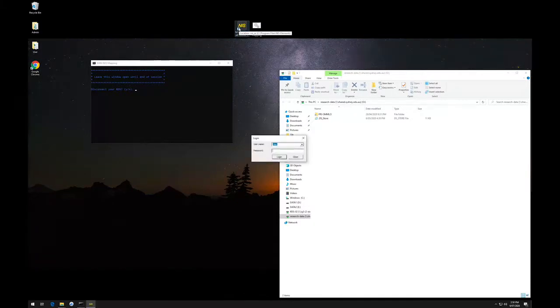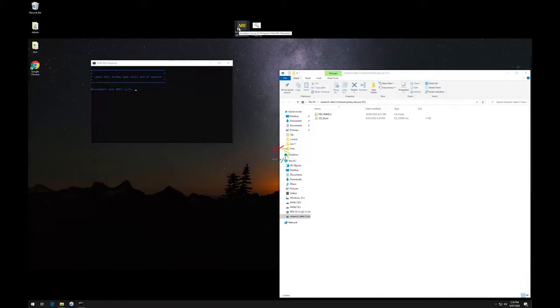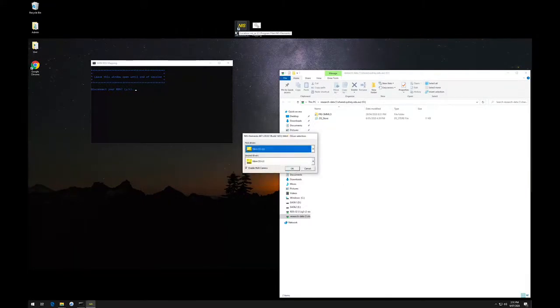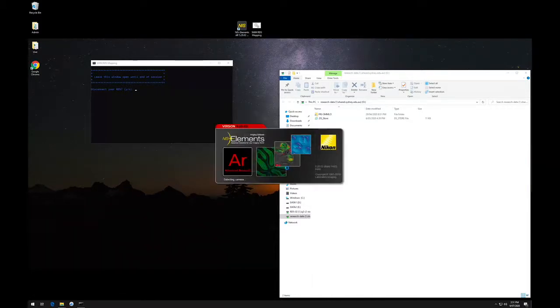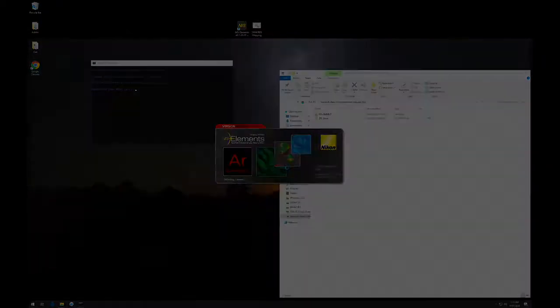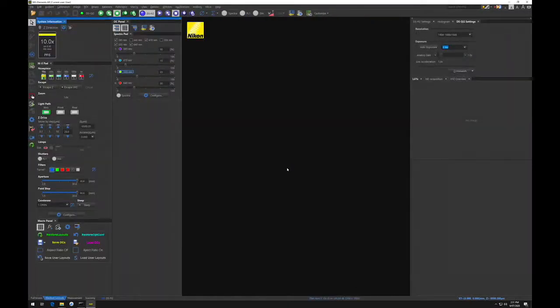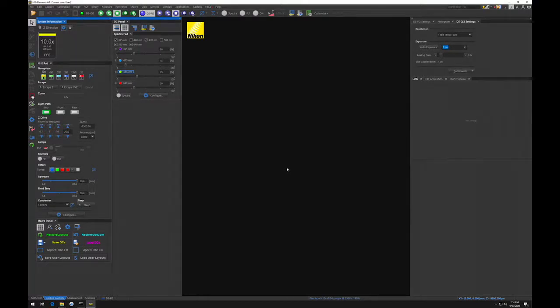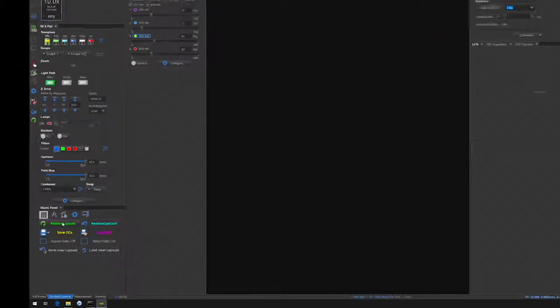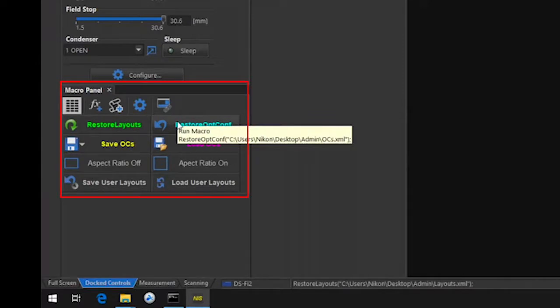Now open the NIS Elements software. Log in as user. If you have forgotten the password, it is written in the manual located on the desk. Once the software opens, check if the layout and optical configurations load correctly. If they did not or you are unsure, click on the macro button to load default OCs and load default layout.